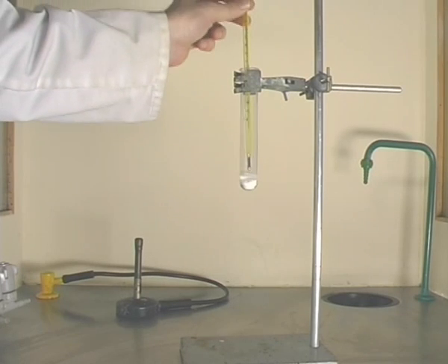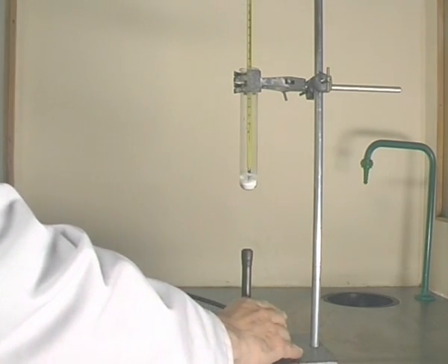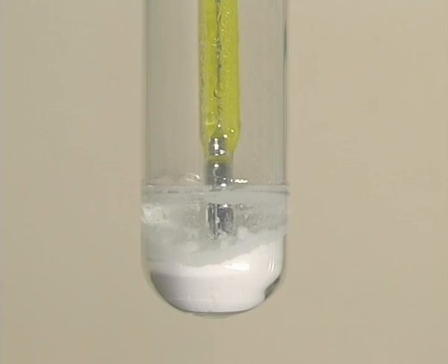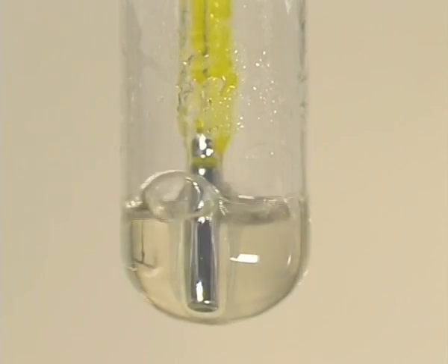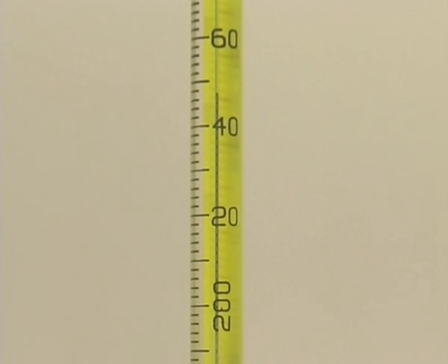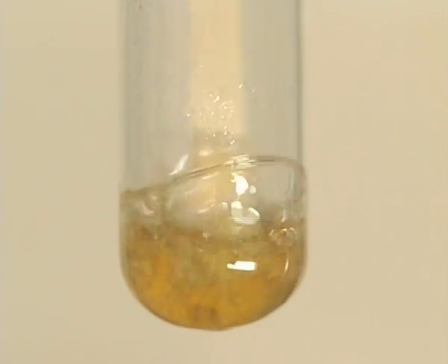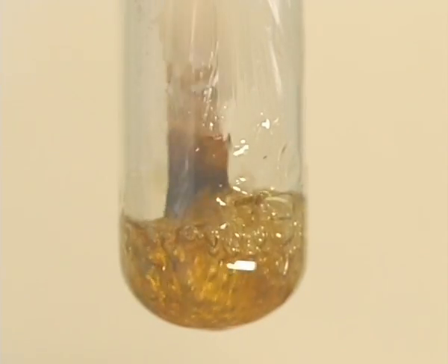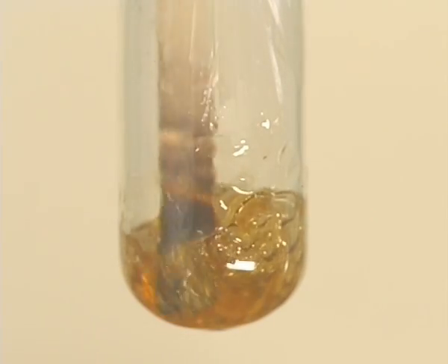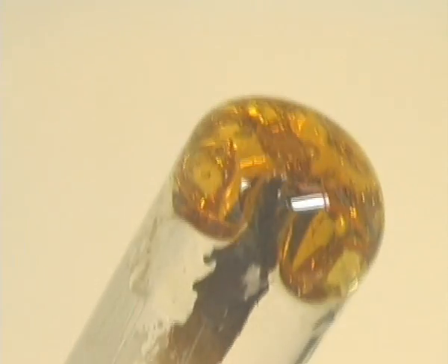The test tube was now heated steadily until a temperature of 250 degrees centigrade was reached. The mixture became progressively darker and more viscous. On cooling, the polyester set to a solid mass.